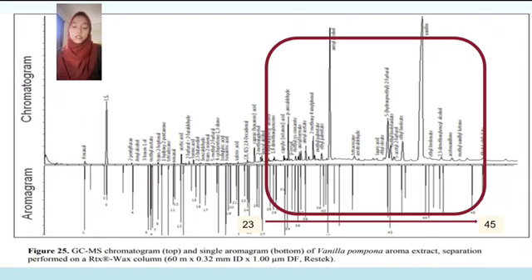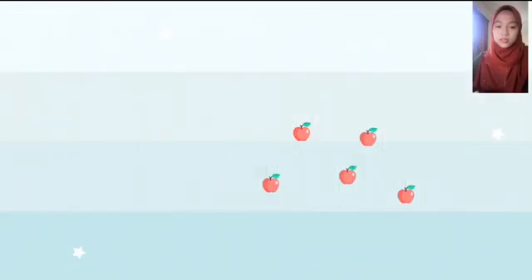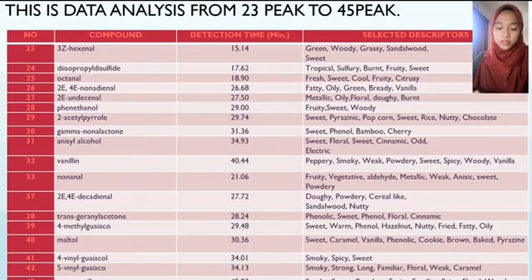For the next data analysis from the peaks, there are a lot of polar compounds by the end of the experiment, where most of these compounds are listed with the fatty, fruity, and floral aroma inside the vanilla.